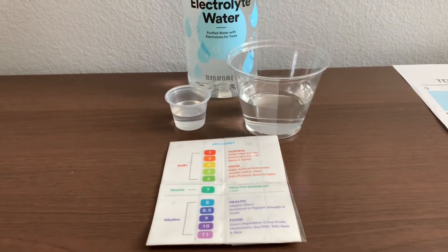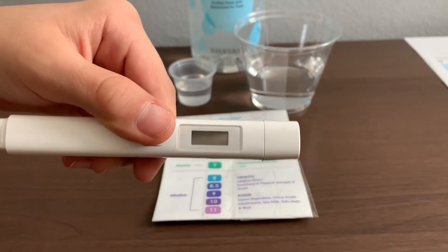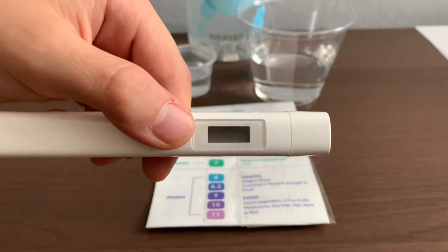First, let's test the TDS level. Turn on the TDS tester. Make sure it says 0 and put it in.